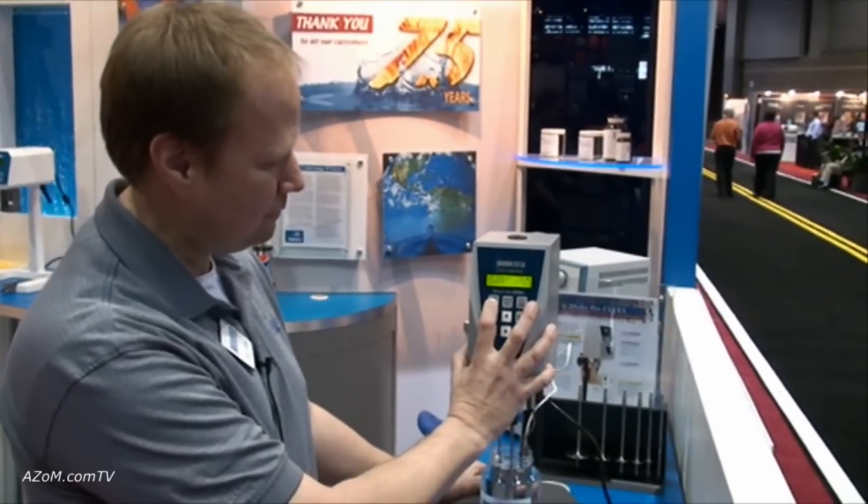Alright David, thanks for your demonstration of the DV2 Pro. Thank you Cameron. Have a nice day.